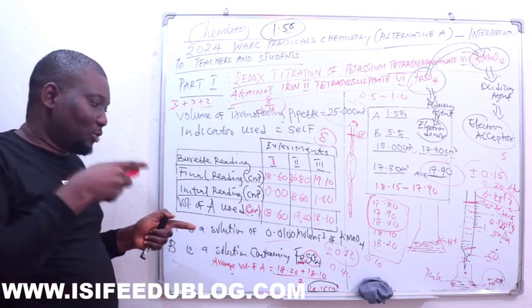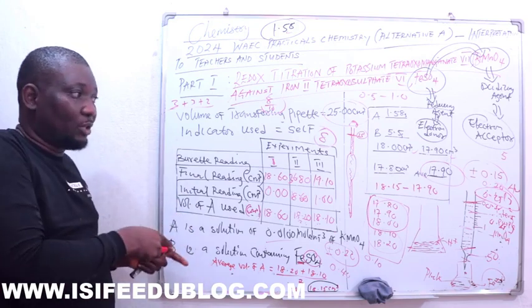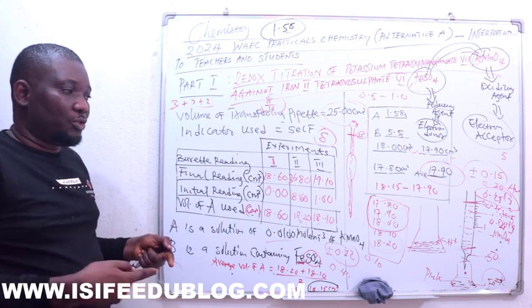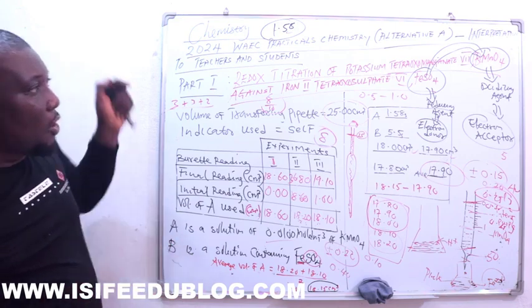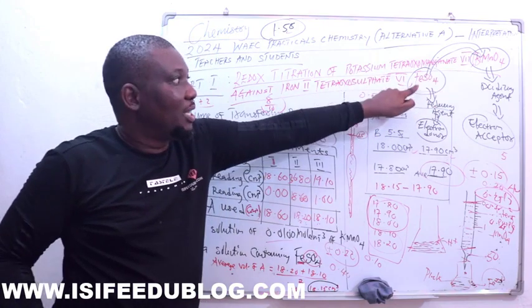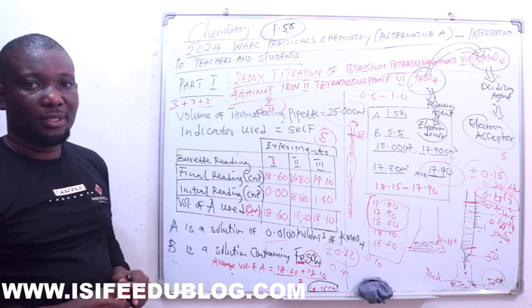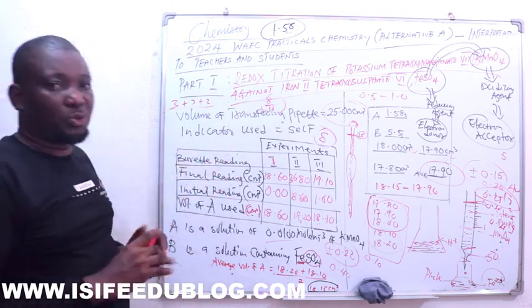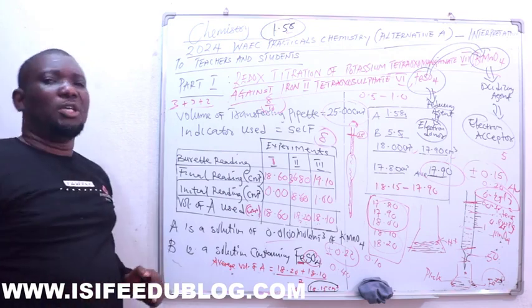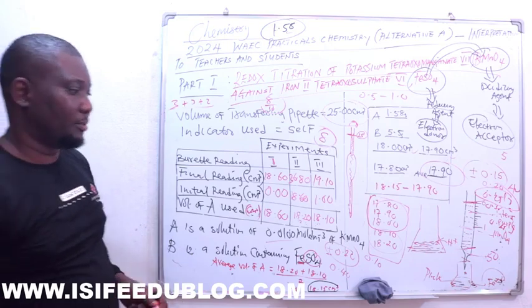What we will now have to do, from this information and the results, is carry out some numericals. The oxidizing agent is the KMnO4. The practical work is done. If you are able to do the practical work very well, the calculation will be very easy, to pick up another mark from there.